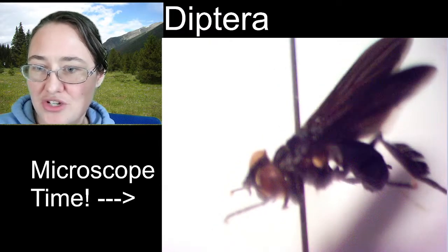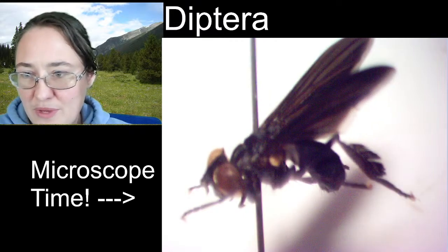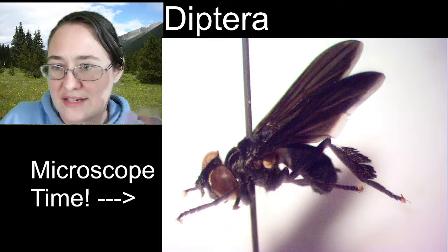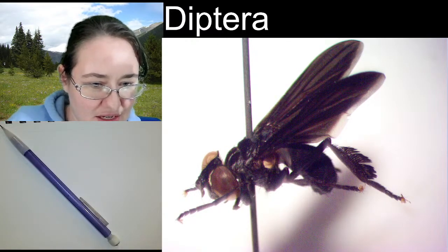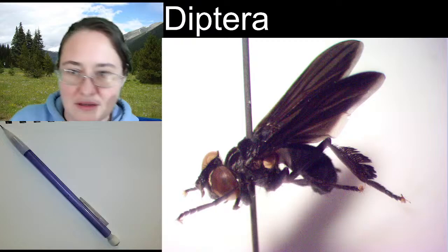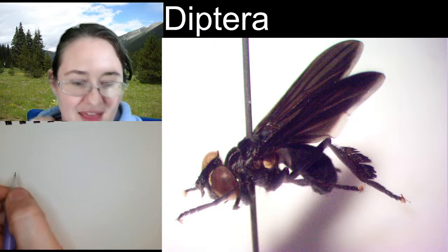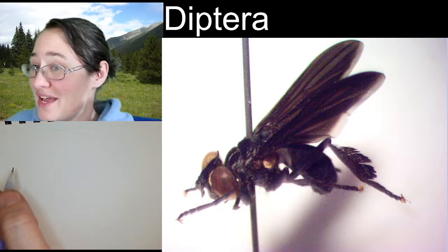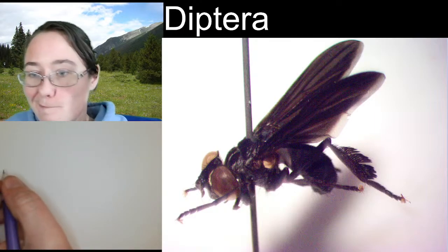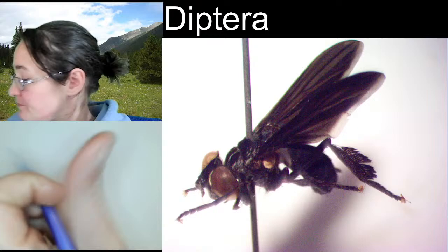Alright, so I'm getting us a good image of the entire body of this fly so that we can get our first sketch on, and then we'll go ahead and zoom in and see all of the other fun characteristics. And some mammals have coarse hairs we call bristles too, like boars. Yeah! I guess that could be it, just like the thickness of the hairs. Alright. So we're gonna go ahead and get started.